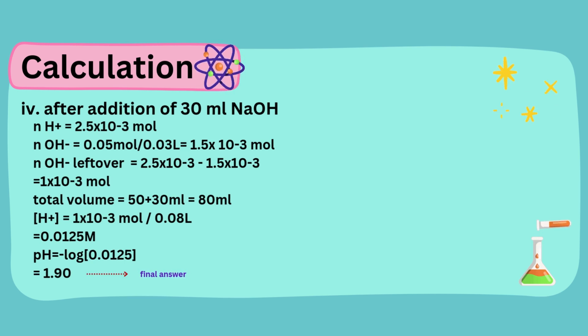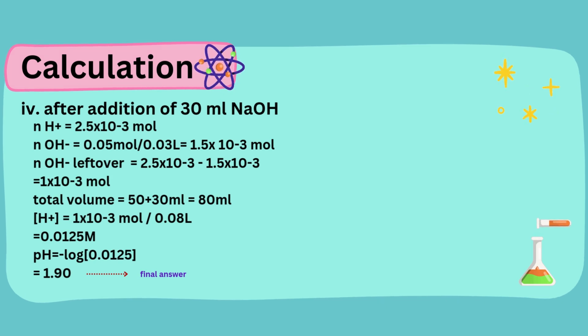We can conclude that the equivalence point does not exist as the pH value is below pH 7 after the overall addition of sodium hydroxide. The experiment is unfortunately unsuccessful.